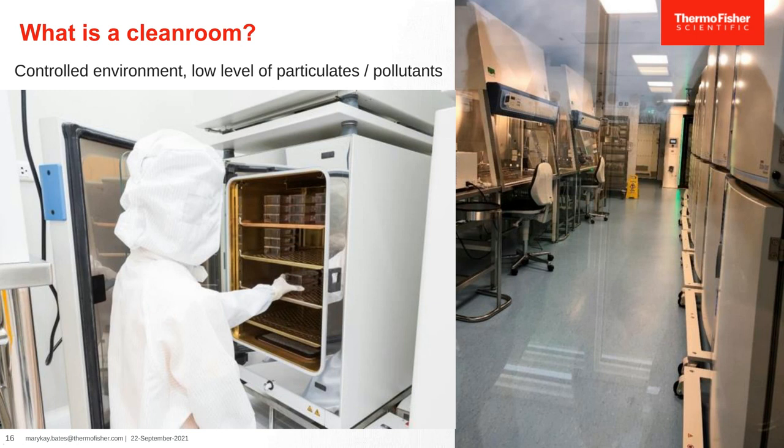So I've mentioned a clean room a few times in this talk, so I want to review what is a clean room, because I think I have talked with a few people who say, well, of course my laboratory is clean. Of course it's a clean room. But a clean room is very different from an R&D setting. So I'm going to spend some time talking about why that is and what makes a clean room so different.